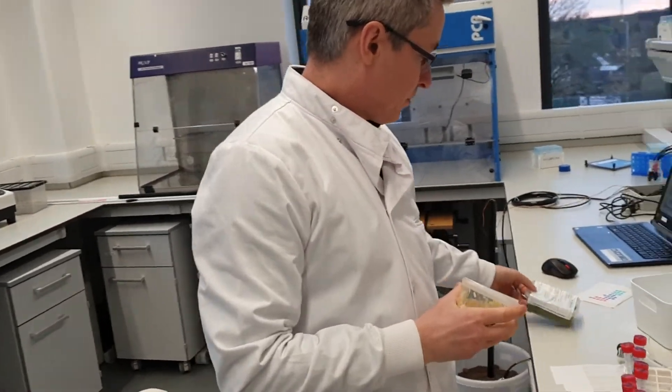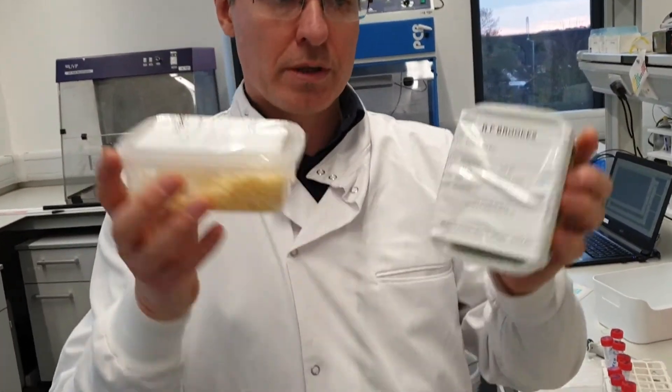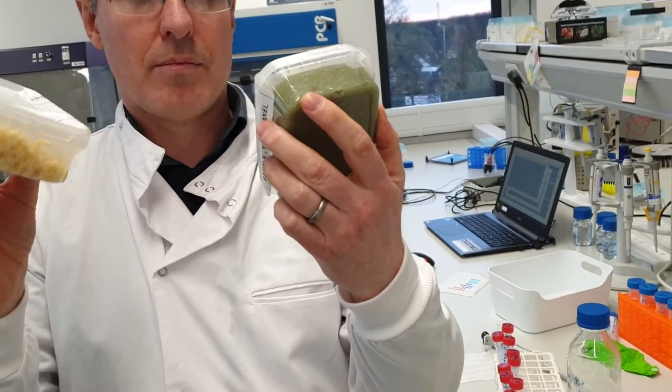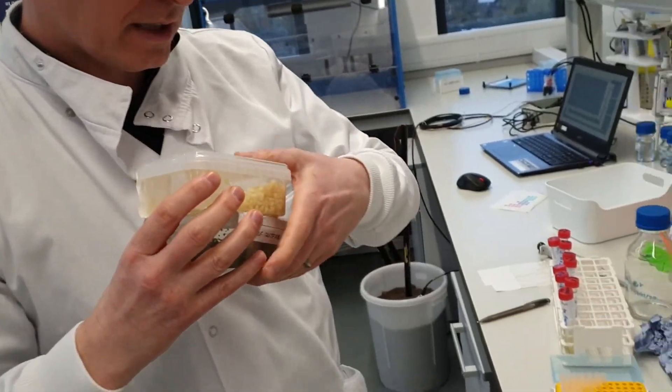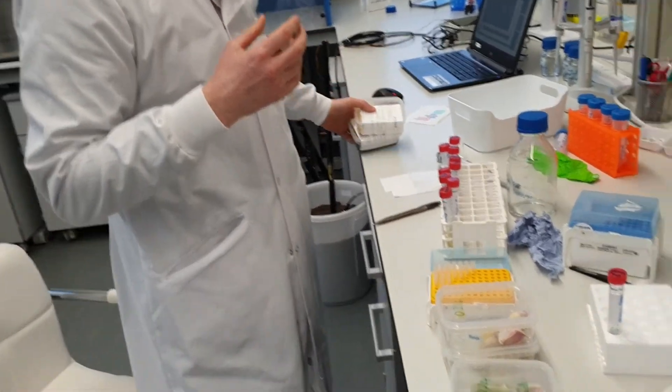things like puree — so if there's a garlic puree that needs testing, we can test that. But it can also be used to test chopped up or crushed cloves as well.